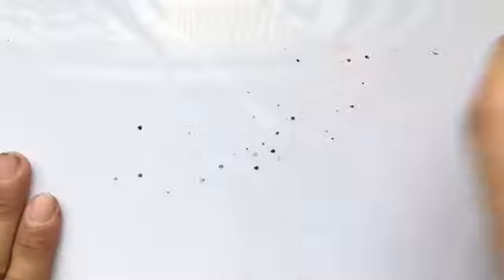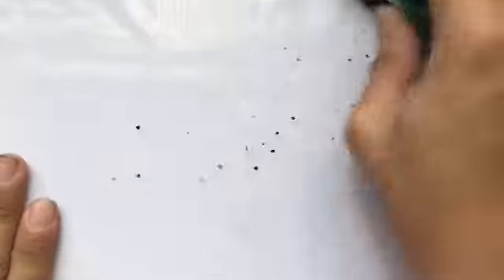So the objective of the experiment is to explain the chemical behavior of salt in water by writing the net ionic equation. So we have several salts. I used permanent marker. Okay, so using a net ionic equation.